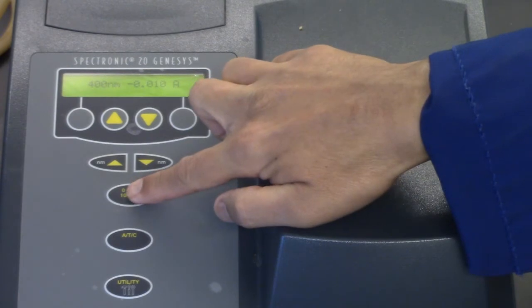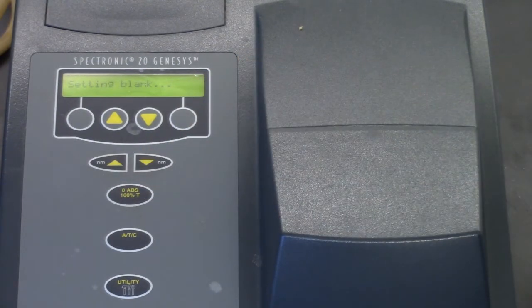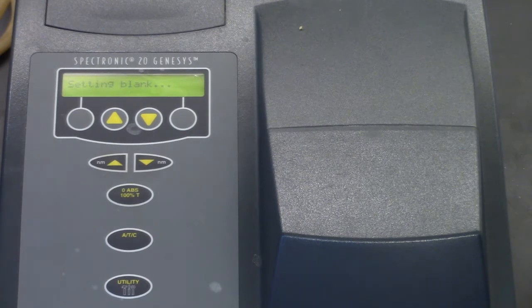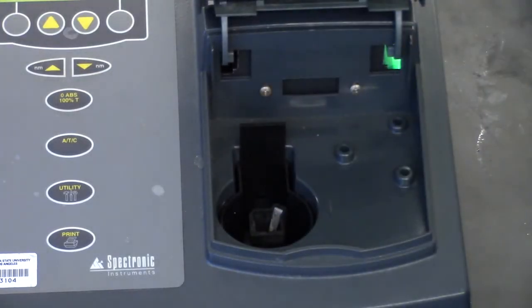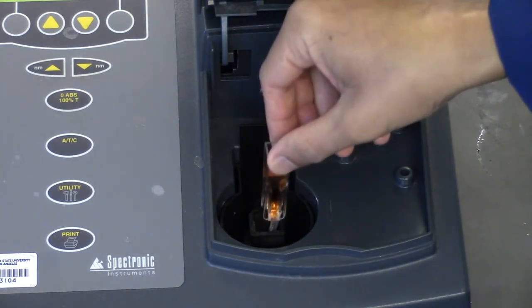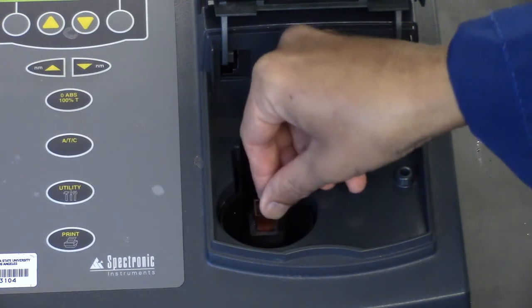Select the starting wavelength and zero the spectrometer. After calibrating the spectrometer at the starting wavelength, insert the cuvette with A3 and close cover gently and measure absorbance.